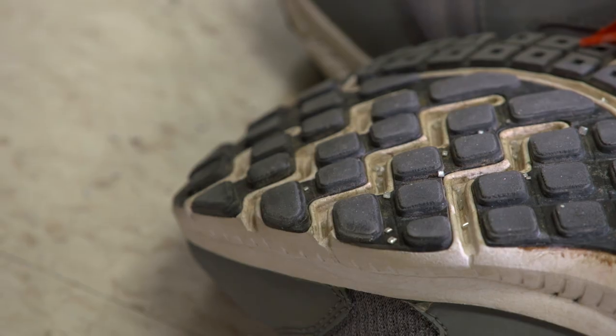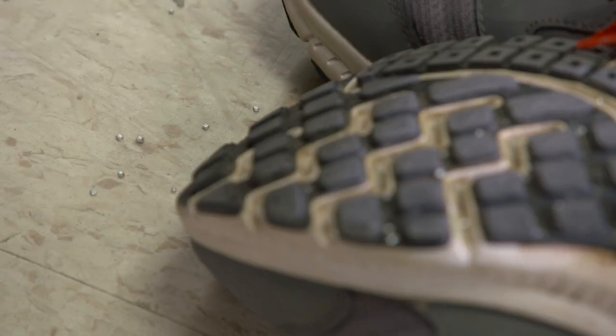Mercury tends to break into droplets when spilled, can spread easily, and can build up in tiny cracks, for example, between floor tiles. If the spill is not discovered right away, or there have been a number of people walking in the spill area, potentially spreading the contamination, then it may be necessary to get professionals to help assess and clean up the spill.